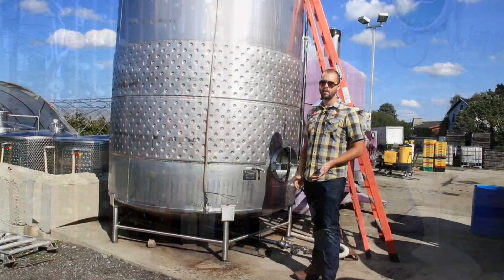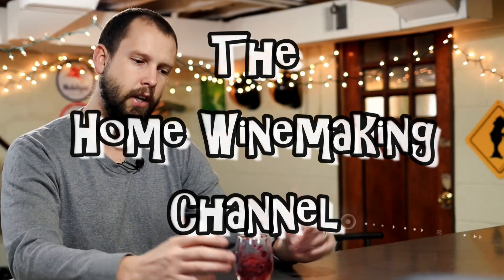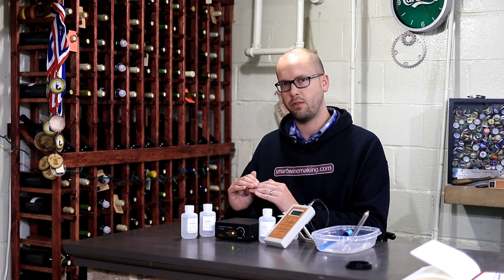Today I'm going to do some free SO2 measurements just to make sure my wines are staying safe. I personally really like to monitor the SO2 in my wine as I enter the aging period and also when it's about time to bottle. Those are two times when the wine is going to sit for an extended period of time and be very vulnerable to microbial spoilage or oxidation. By keeping those SO2 levels adequate, you're really going to virtually eliminate that risk.